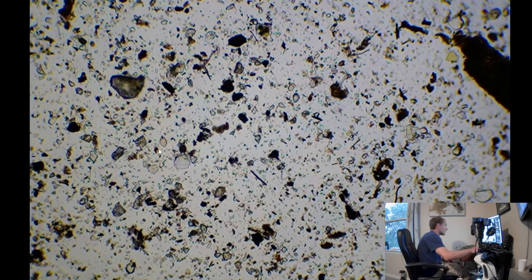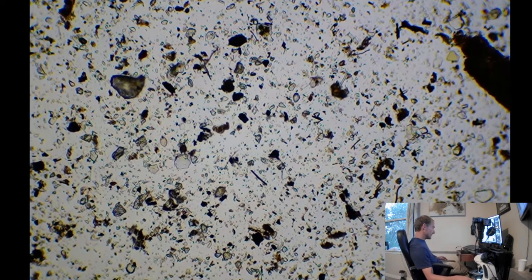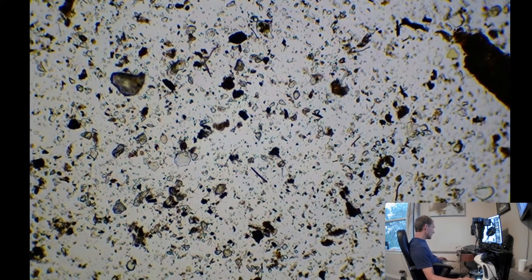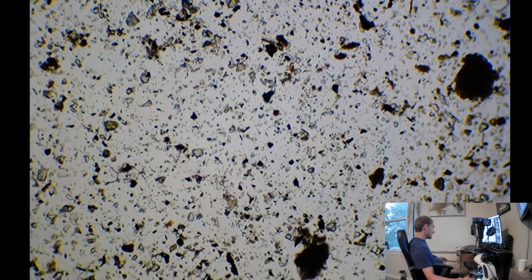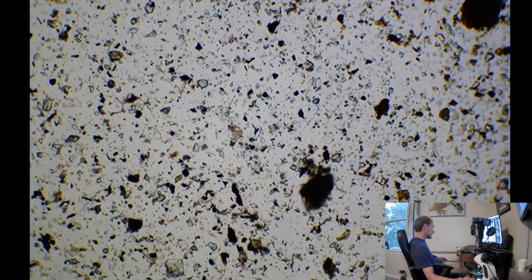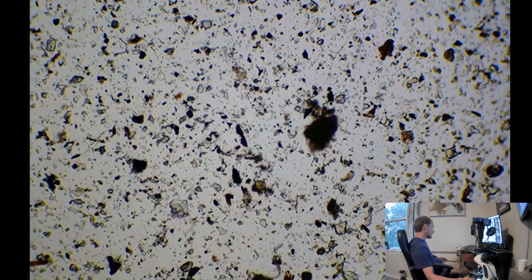That looks like a nice little football-shaped fungal spore, would be my guess. Usually they're a little darker when I see them, for certain.